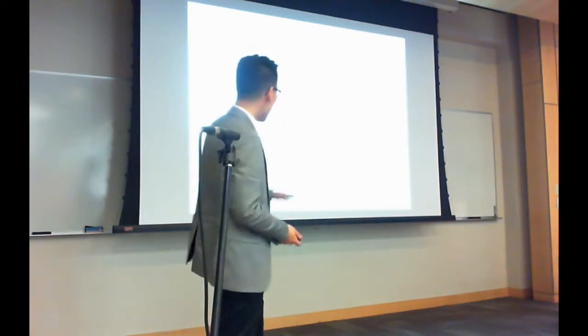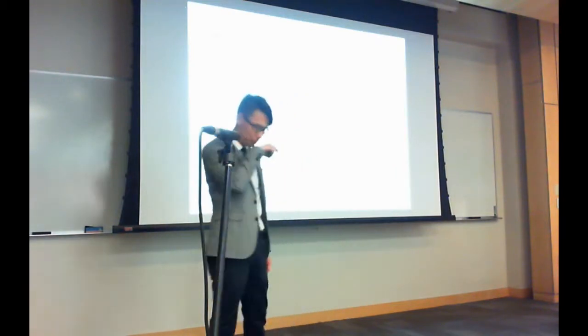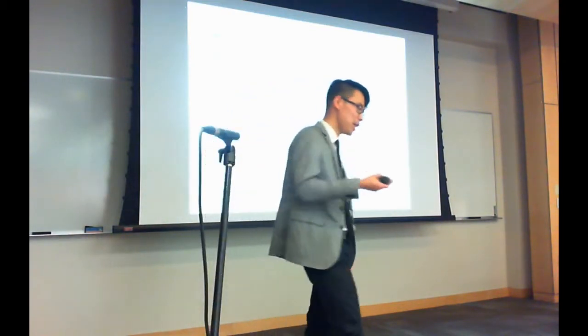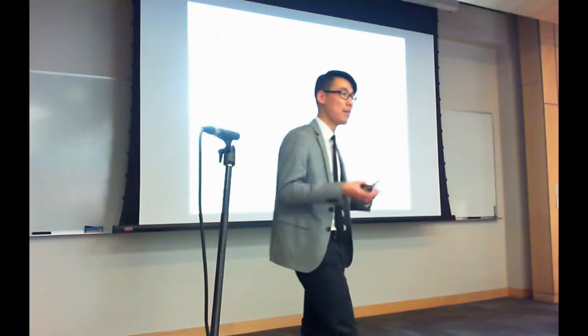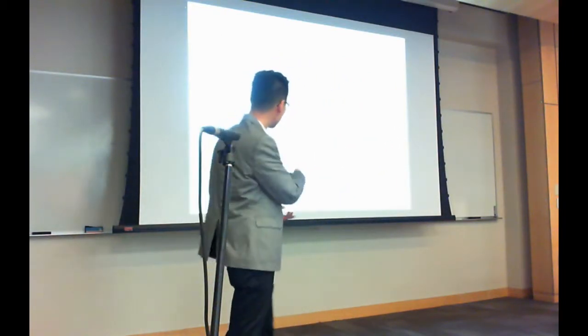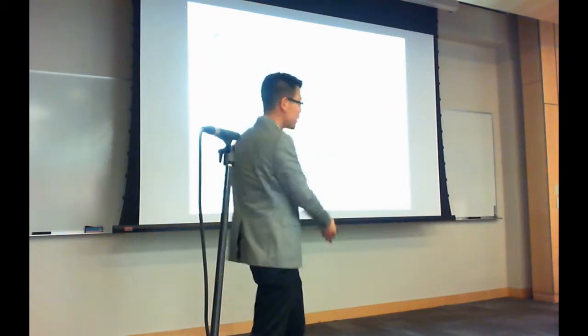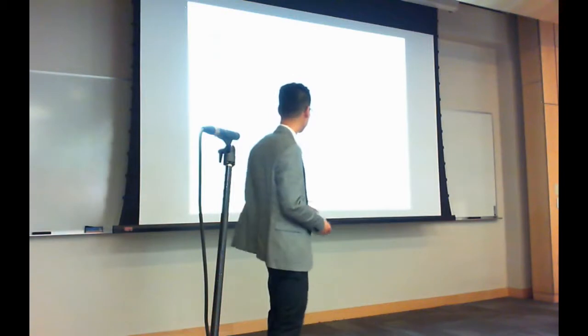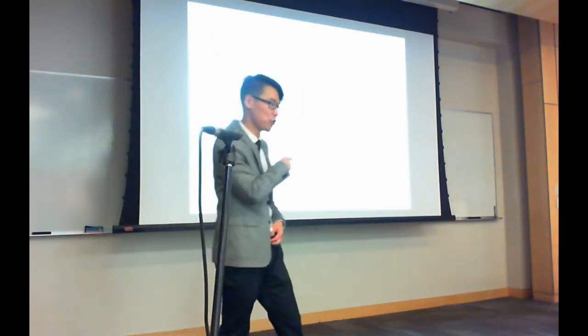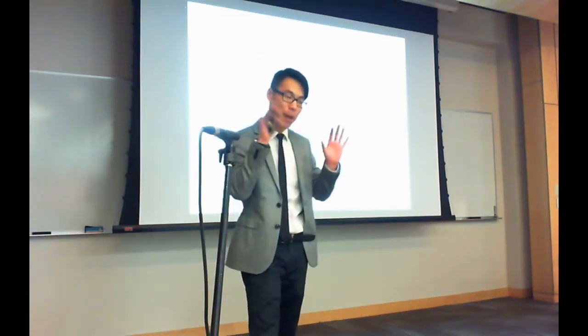And then this term here is the spectral probability, and that tells us the probability of a random peptide matching with a higher score than t. So this is an error rate, and lower is better. If it's all the way down to 0, there are no better peptides to explain it. And this captures the quality of a peptide explaining all the data in a spectrum.